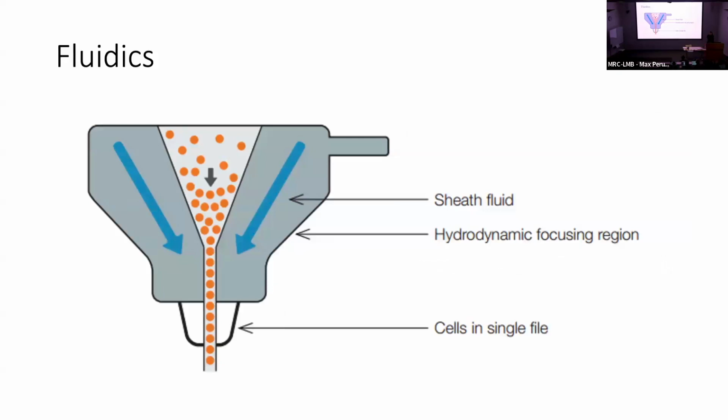All right, so a really basic overview of flow cytometry. It is machines that are comprised of fluidic, optical and electronic components. Essentially, the fundamental fluidic component, as I mentioned earlier, has the principle of hydrodynamically focusing your suspension of cells. Essentially, we have a core stream, which consists of your sample itself, and then using a hydrodynamic fluid focusing region with sheath fluid, we get the cells focused in a single cell file based on the Bernoulli effect, where eventually they will be pulsed by lasers.